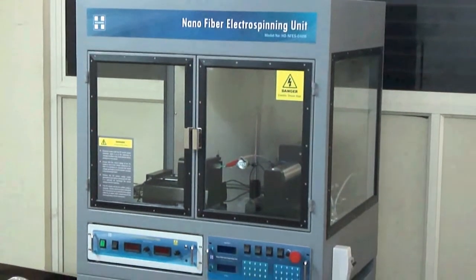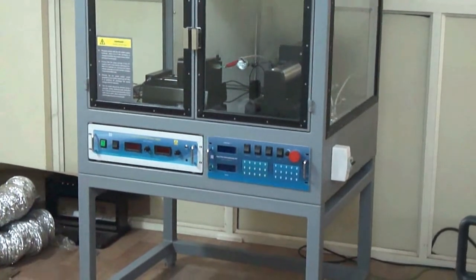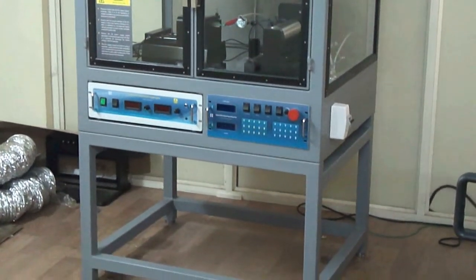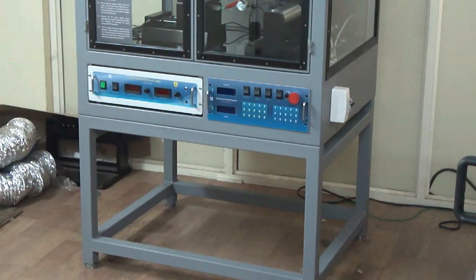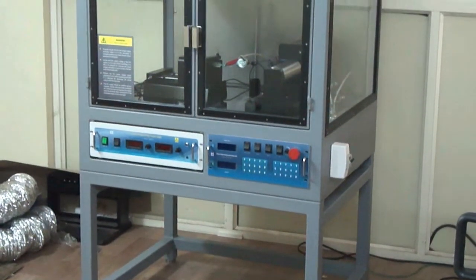Hello and welcome to HOMARC's product demonstration of the tabletop model of HOMARC's nanofiber electrospinning equipment. This model has been designed as a compact and more space-effective version of the standard nanofiber unit.